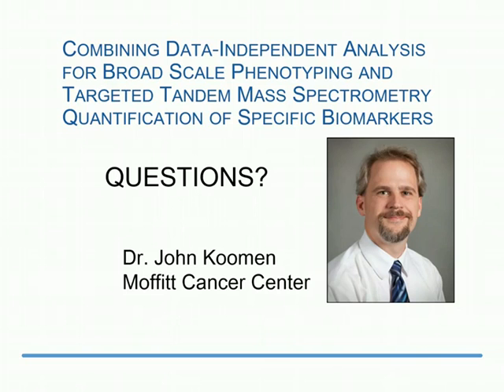Next question coming in, it's kind of a two-part. It says, can you just define what is a DIA window and what decides the length of a DIA window? Sure, absolutely. So every time you do an MS-MS experiment in a mass spectrometer, you set a particular window around, in the data-dependent acquisition method, the precursor that you're trying to select. And generally with these hybrid ion trap type of instruments, we would use about 2 mass to charge. So if you wanted to look at a peptide that you observe at mass to charge 500, you'd select from, say, 499 to 501, or you might want to have it offset slightly from 499.5 to 501.5 to capture more of the isotopes. But that's the definition of the window.